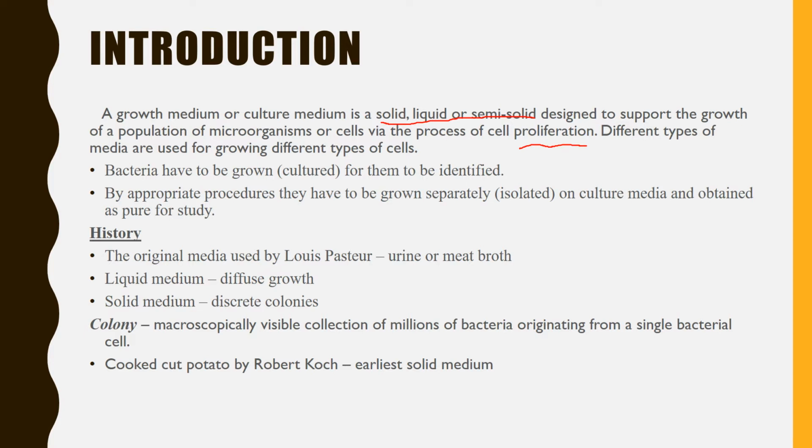Bacteria and fungi have to be grown for them to be identified, and by appropriate procedure they have to be grown separately on the culture media and obtained as pure cultures for the study.